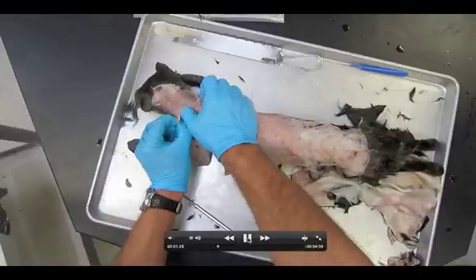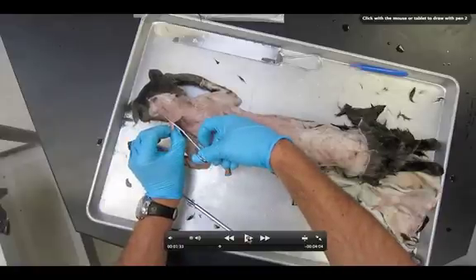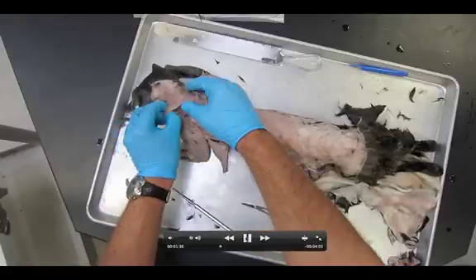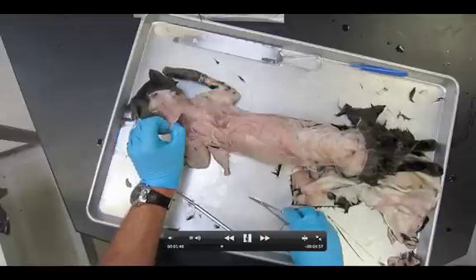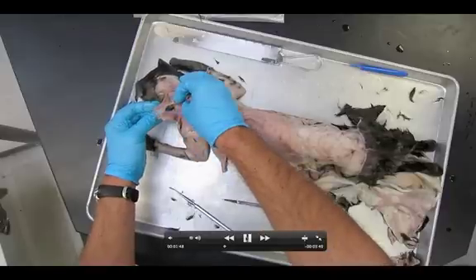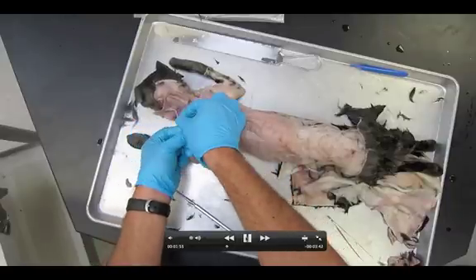Now I'm getting underneath the clavotrapezius, using the probe as a guide. Right down here you can see the levator scapulae ventralis. I'm going to cut the clavotrapezius, making sure I don't accidentally jab any muscle below. Do not go on to dissection two if dissection one is not first finished. I'm pushing down the levator scapulae ventralis to make sure I don't accidentally snip it, and there we go — cutting through the clavotrapezius.